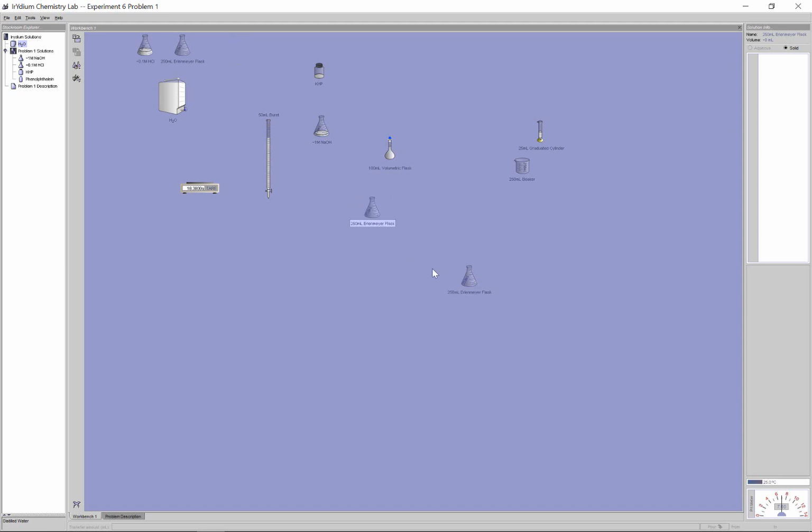What I'm going to do is put 3 different samples of my acid into these Erlenmeyer flasks. I'm going to pipette my standard solution into these 3, and then I'm going to titrate against this NaOH. It's just better chemical technique if you take your volumetric flask, which I know I made 100 milliliters, and pour that 100 milliliters into a clean beaker. You might be surprised that by the time you pour it, it may not exactly line up with the 100 ml mark on the beaker. That's totally fine because we're just using the beaker as a holding vessel.